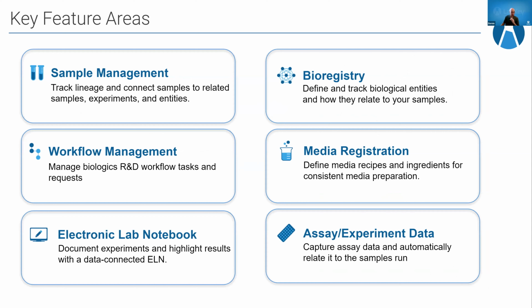You might have heard enough from me to predict the composition of our biologics LIMS, but allow me to briefly outline it for you. These, as you can see on the screen, are a couple of the key feature areas. They include sample management, and this is what you saw in the demo yesterday of our sample manager product. All of those functions are available at all of the tiers of our biologics LIMS, and those sample manager functions allow you to track lineage and connect samples to related samples, experiment data, and entities in the system. You get to define all of those different sample types.